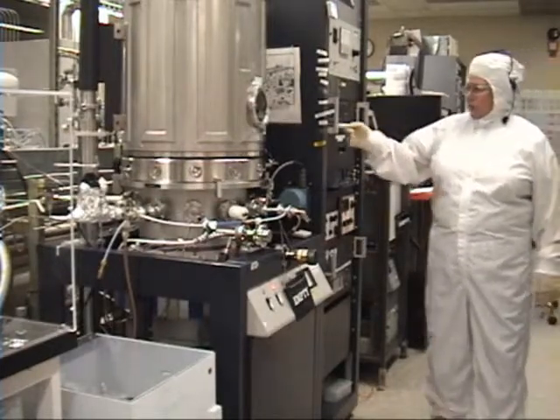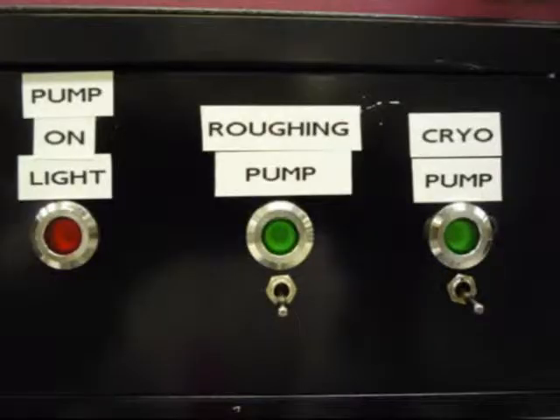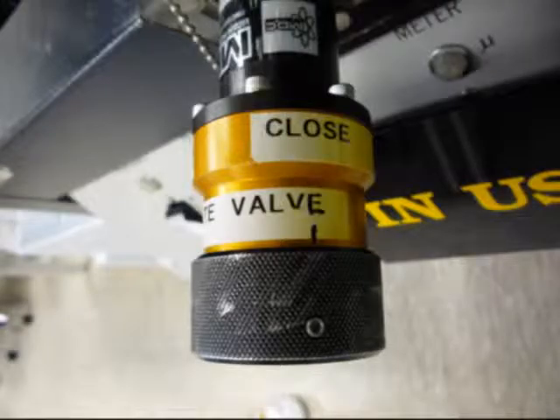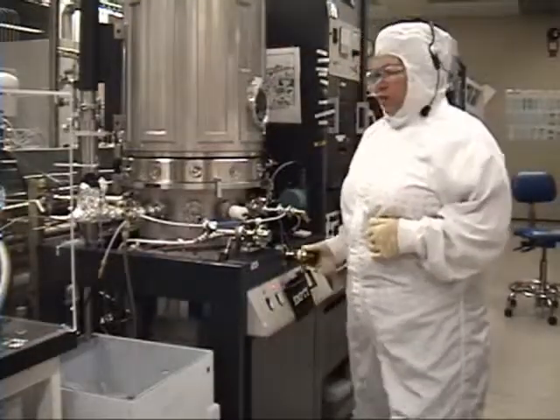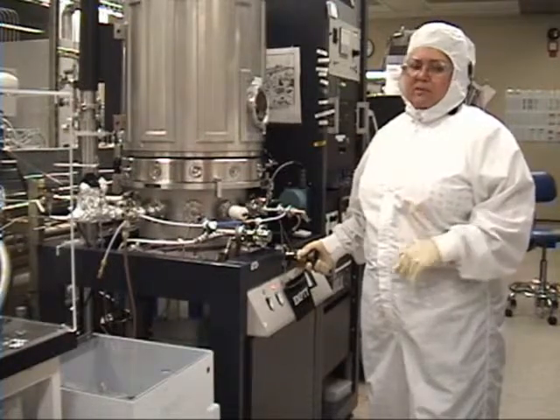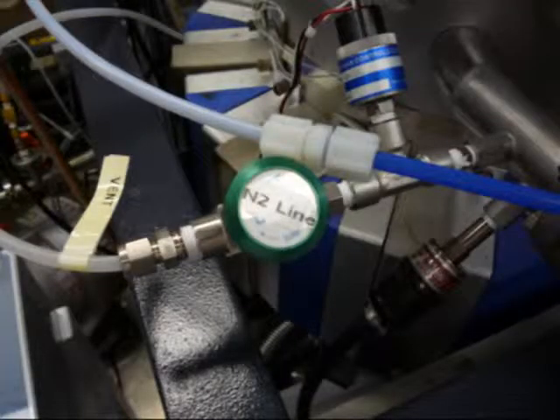You're going to check to make sure that the high voltage toggle is up. You're going to make sure that the roughing pump cryo toggles are down. The red light is off. You're going to make sure that your gate valve is closed clockwise. You're going to make sure your roughing valve is closed clockwise. And these two valves — roughing and gate valve — may never be open at the same time or you're going to backfill oil into the chamber. You're going to make sure your N2 valve is closed.